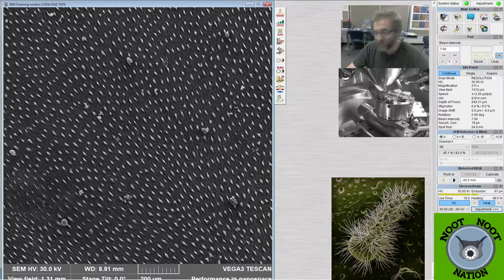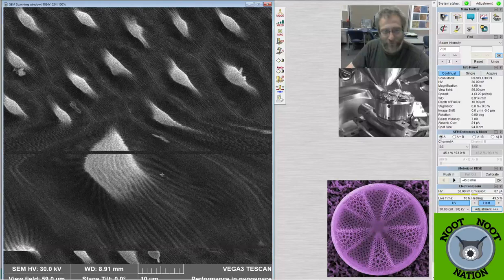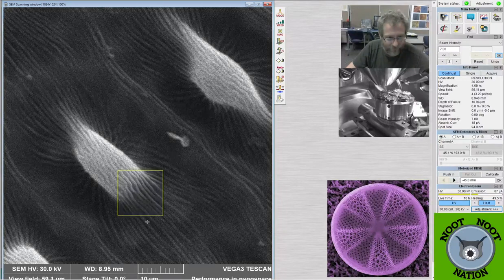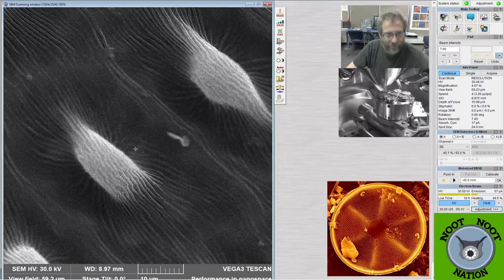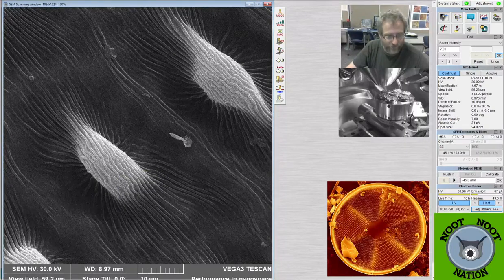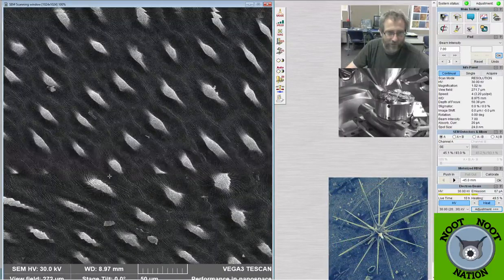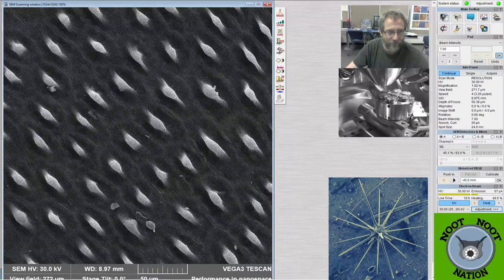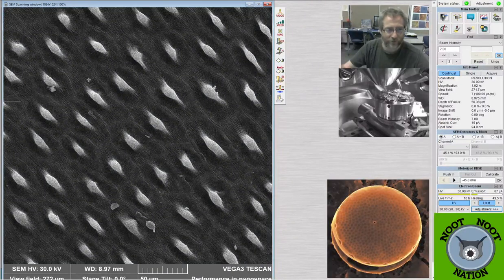I'm going to fix the resolution, then zoom in, take a picture, zoom in and get the image quality right, the focus right, and then zoom back out because that was cool. These things are really interesting to see, but repeated structures and textures are the best. Okay, there we go. Nice high resolution. You can see the individual cells, and then we're just going to go backwards from that. So there's a nice repeat image, right? Those repeated cells over and over. I'm going to do one like this, and then one where we're zoomed out even farther.